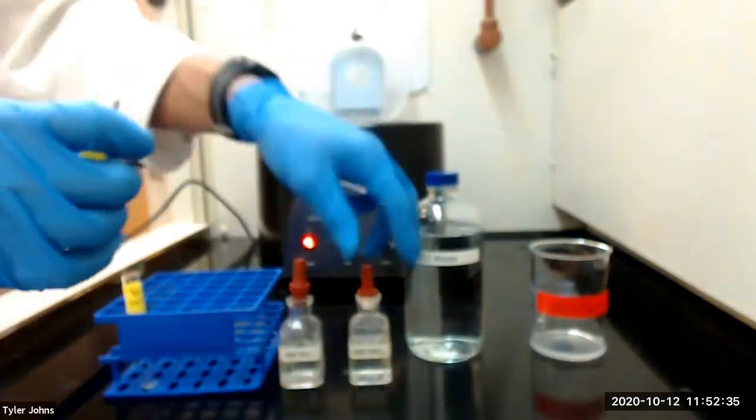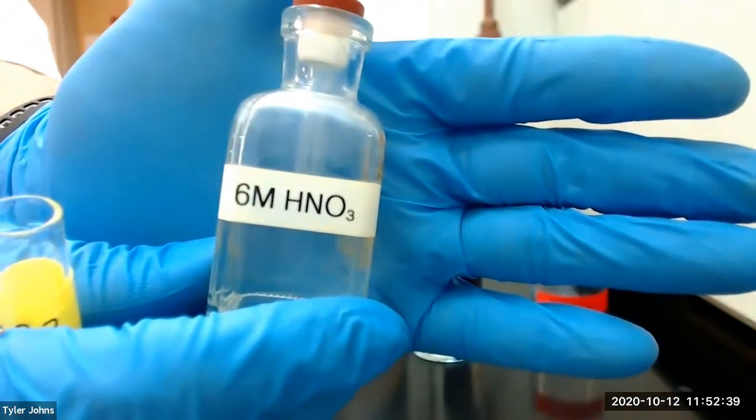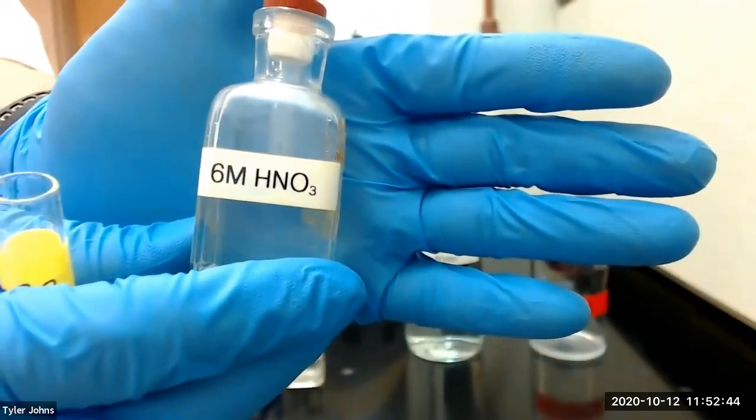We will then acidify our S3 solution with dropwise addition of six molar nitric acid until a blue piece of litmus paper turns red.